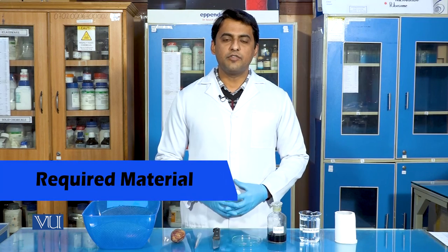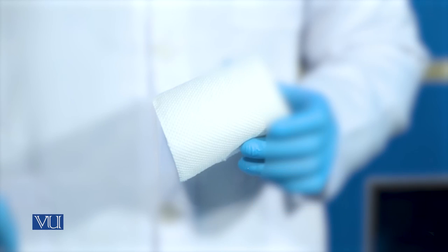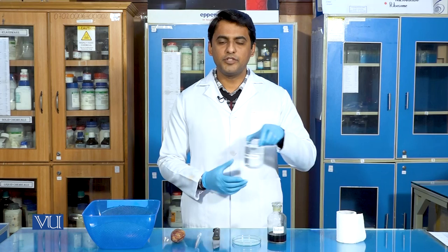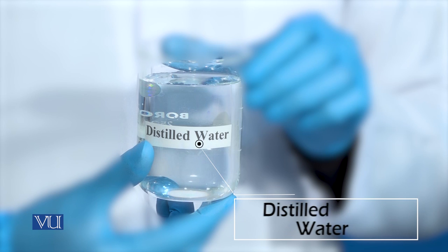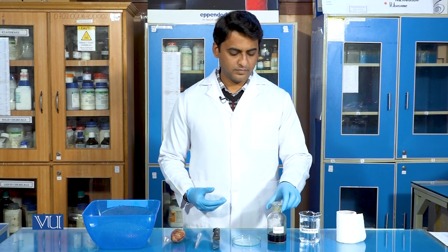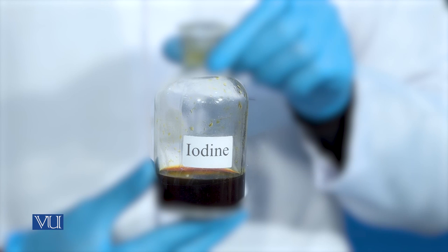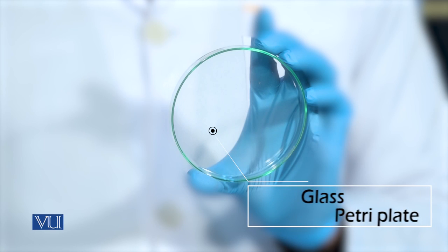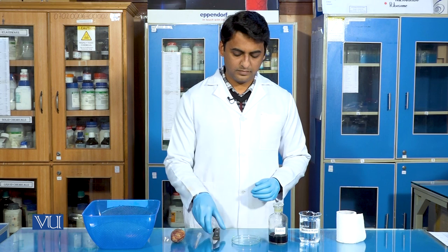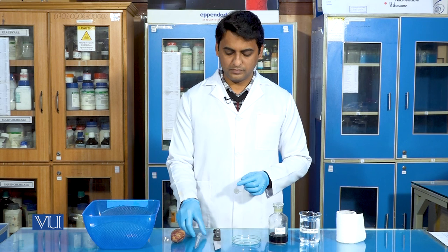The materials required for this experiment are: tissue paper, which we will use for the drying of our food sample; distilled water, which we will utilize for the washing of our food sample; iodine solution; a glass petri plate; a sharp knife; and a dropper.